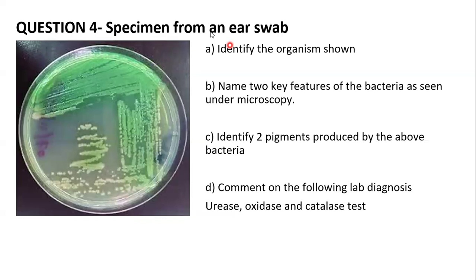Yeah, you can see. What I know is, you remember one of the bacteria, which bacteria am I thinking about? The highly motile one. Was it Listeria monocytogenes? Do you remember Listeria monocytogenes, which shows the, what's the name? Tumbling motility? Yes. So yeah, you can see it under microscopy.